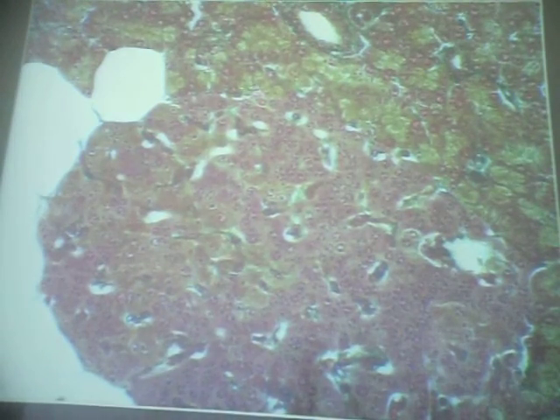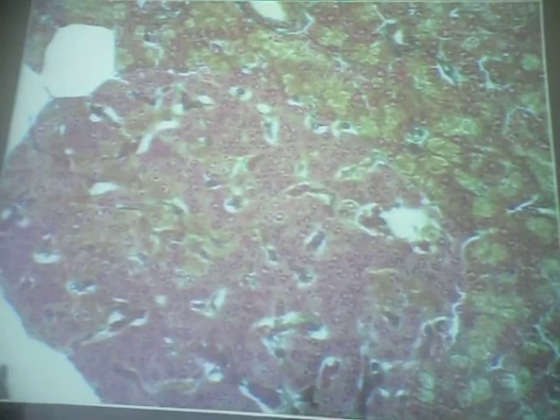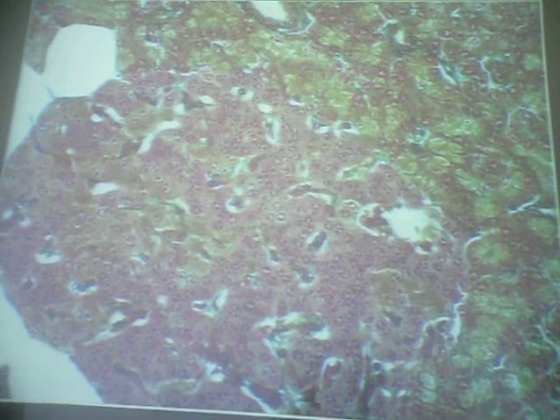That surely doesn't look like the pancreas we saw before. It doesn't look like the same pancreas? No, it does not. It's stained differently to show the different cell types, which I'm going to ask you to pick out. That's why. So enjoy the color, okay?